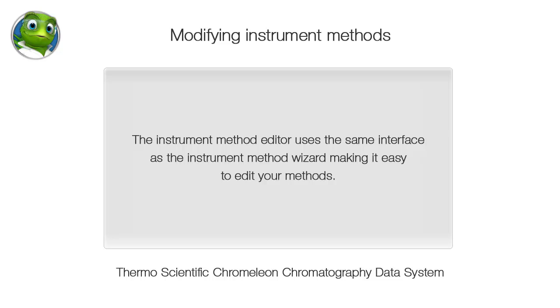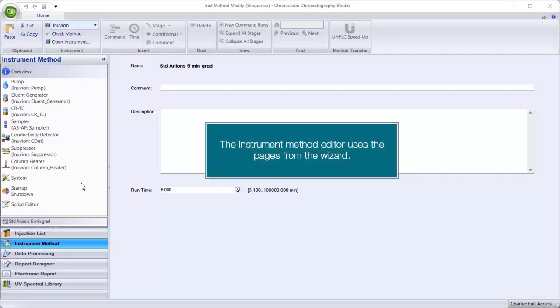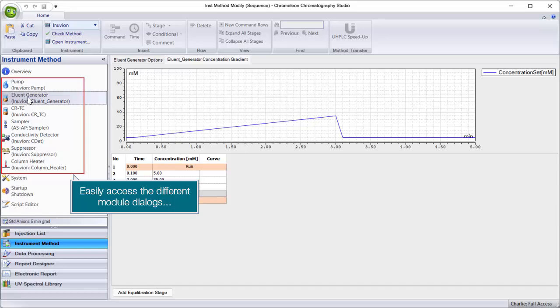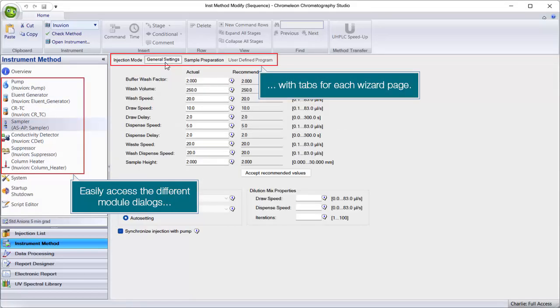The Instrument Method Editor uses the same interface as the Instrument Method Wizard, making it easy to edit your methods. The editor uses pages from the wizard, allowing you to easily access different module dialogues with tabs for each wizard page.